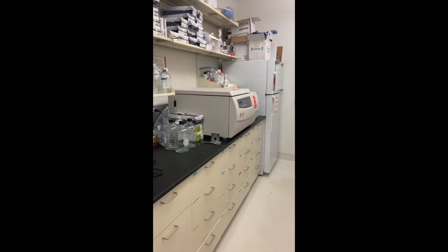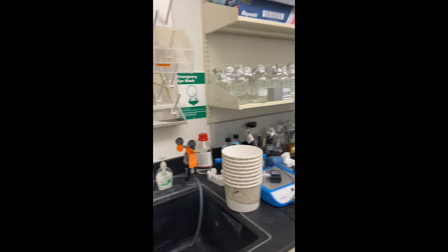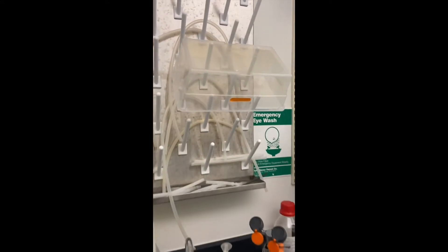Hi everyone. I'm in the room next to the main lab right now getting supplies for the blood feed, because it is a Tuesday.